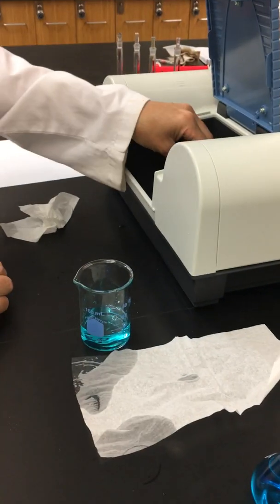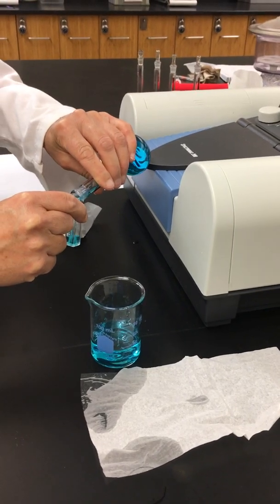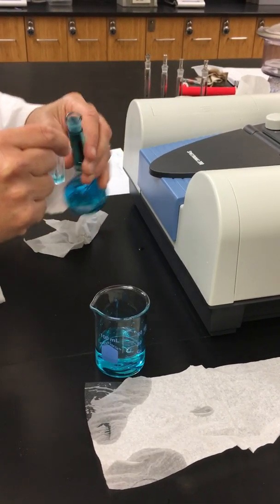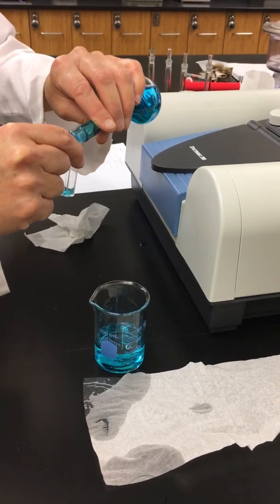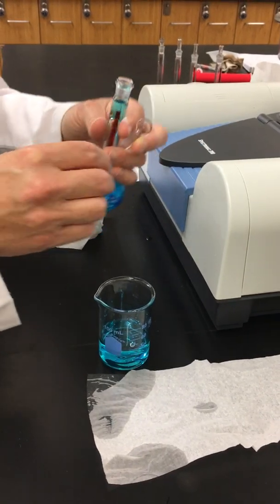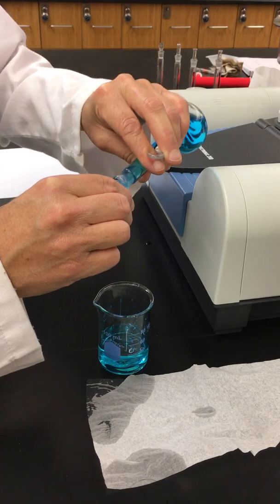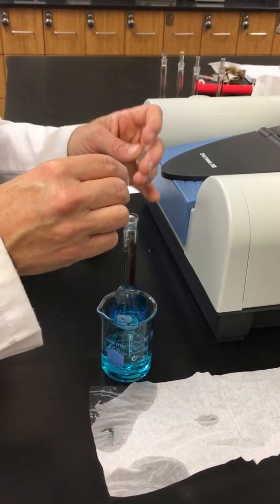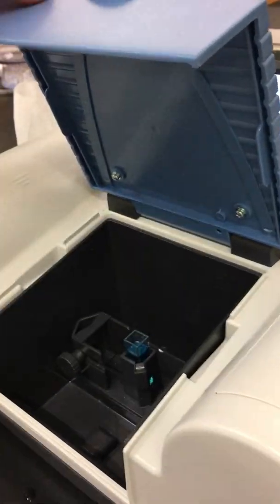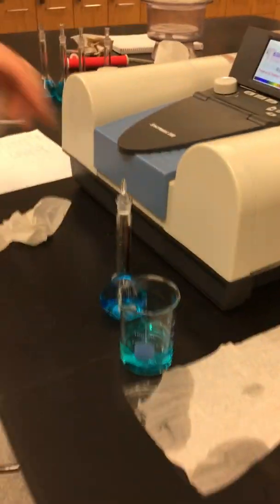Now we're ready to do our last dilution. We're doing solution number five. Following our same procedure, we'll rinse it out first. Sometimes it creates a little vacuum around that neck of the volumetric flask. And we're ready to do our last dilution. Solution number five has an absorbance of 0.99. So we've now done the five dilutions.